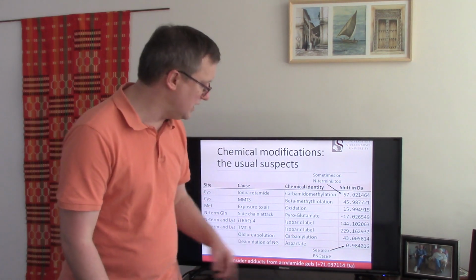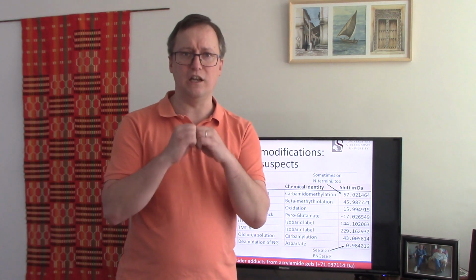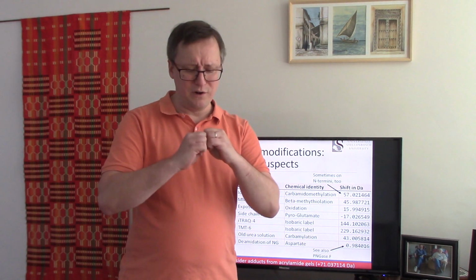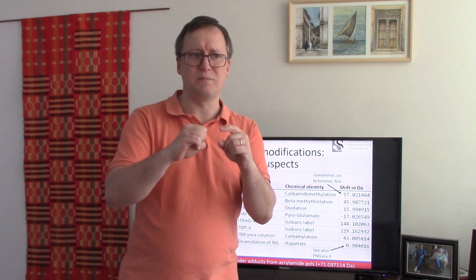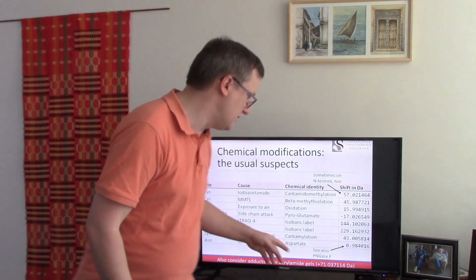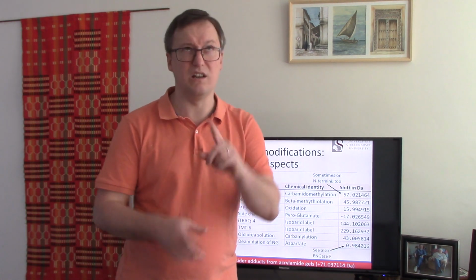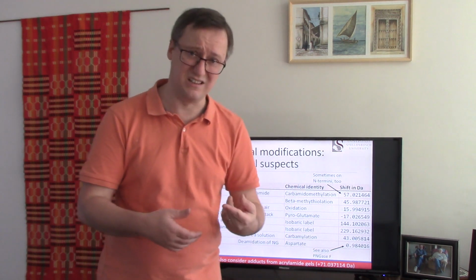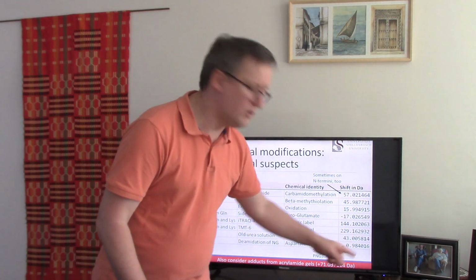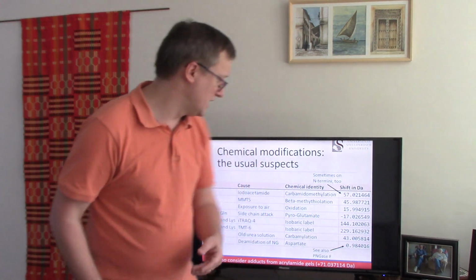Okay, the last one someone reminded me to mention is deamidation. So it might be that you have a motif of asparagine followed by glycine in your peptide. There's a weird succinimide mechanism by which the side chain of the asparagine can attack the glycine, and lo and behold, you end up replacing the asparagine, in half the reactions if I remember, with an aspartate, which means that you gain one mass unit by just the chemistry sort of blinking on you.